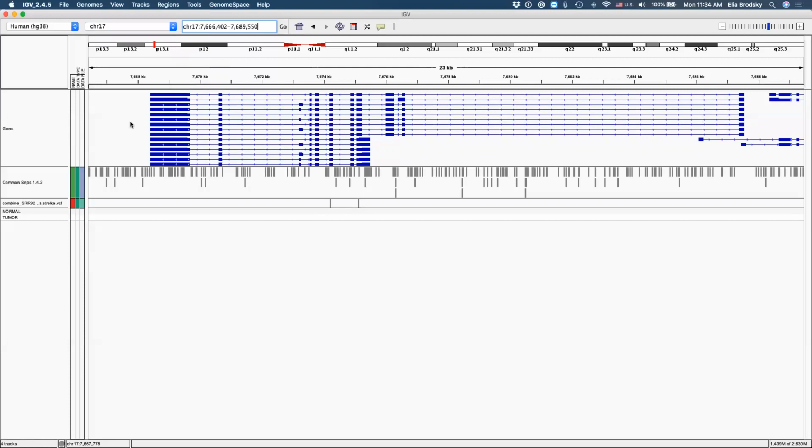And our goal is to now understand the analysis steps so that we also understand how to deal with the output, not visually, but from a statistical perspective, selecting the most important and critical variants that we can then try to associate with a specific phenotype. And the phenotype here is going to be a subtype of a specific cancer, a specific prognosis, a risk factor, etc. Those are going to be the risk factors that we will look at.